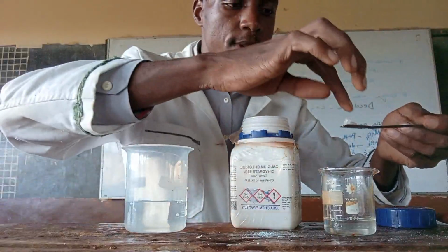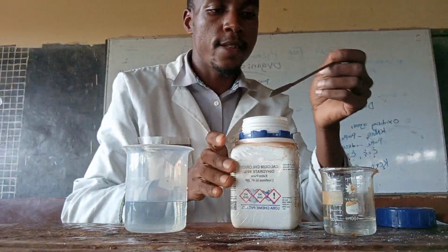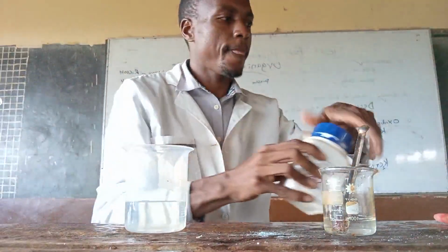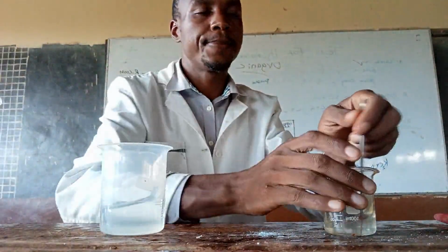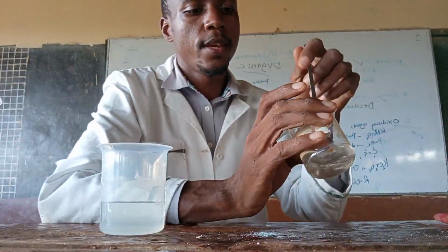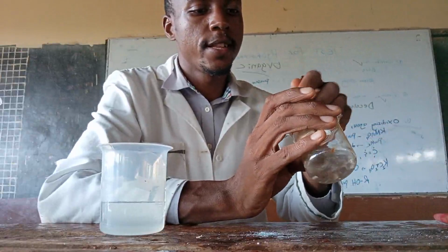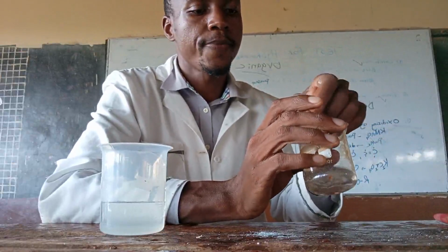Now, I want to add it here. And then I start. After stirring, the white solid I added here dissolved.